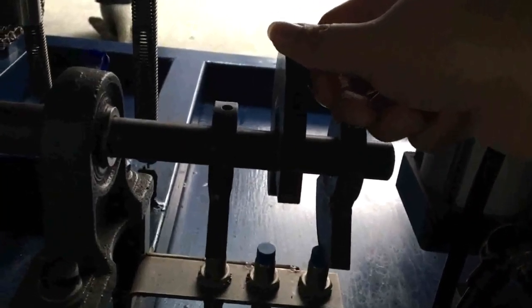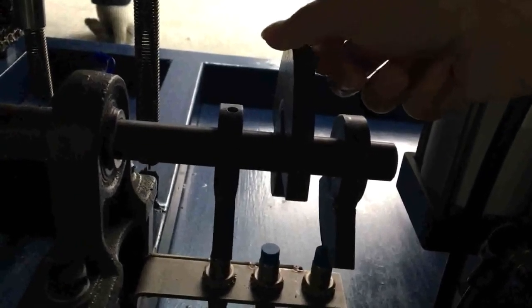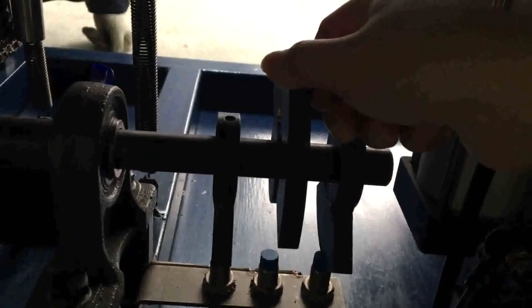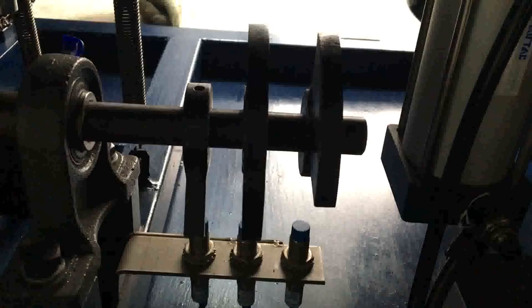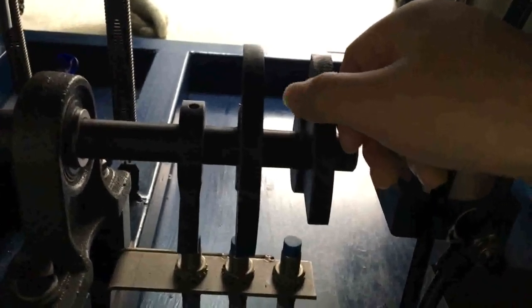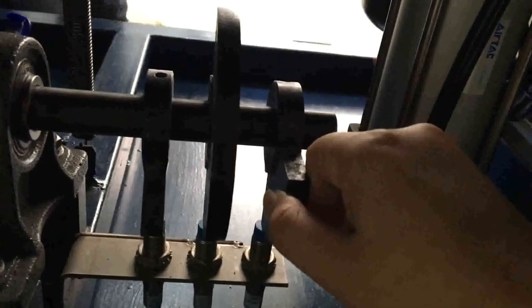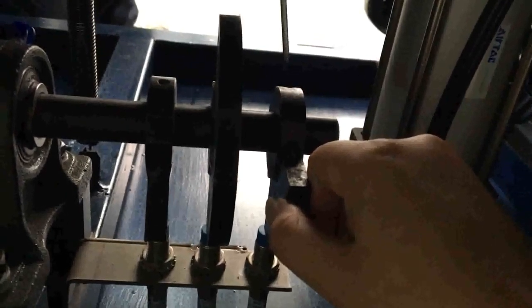First, adjust the clamping and cutting signal cam. Rotate the cam in this direction from the top. When the cam activates the button, lock the screw on the cam. Then adjust the tube loading cam — rotate the cam in this direction. When the cam touches the button, lock the screw on the cam.